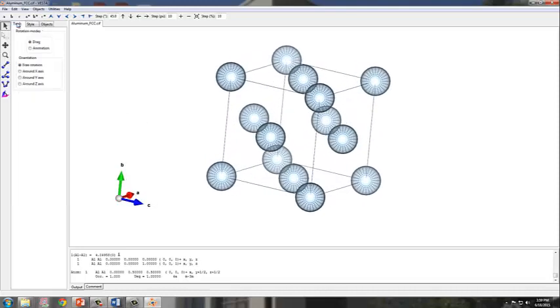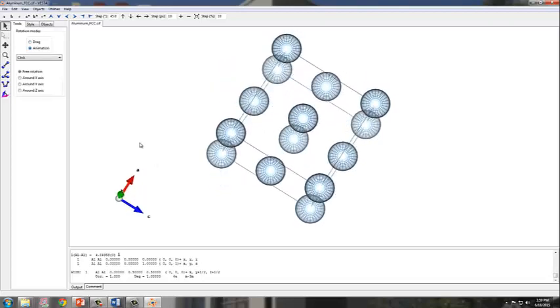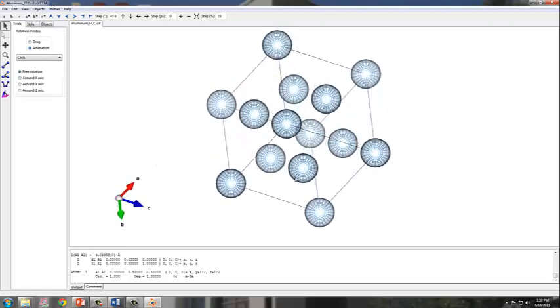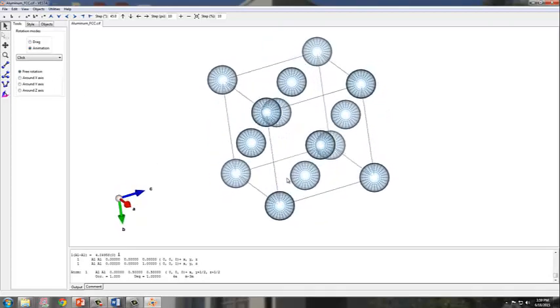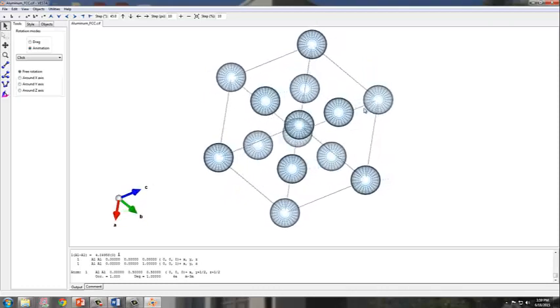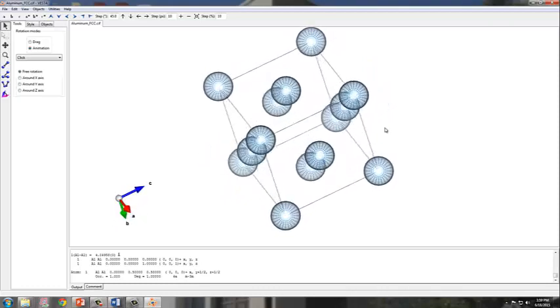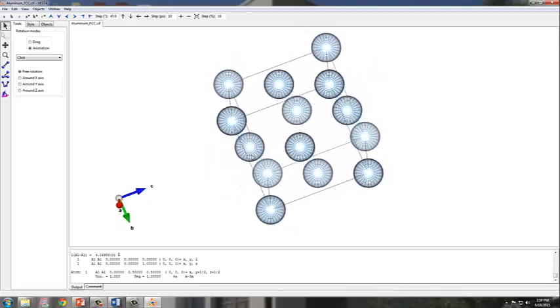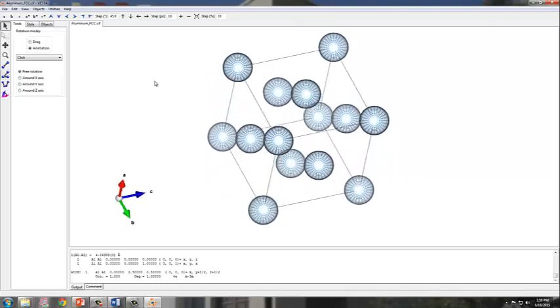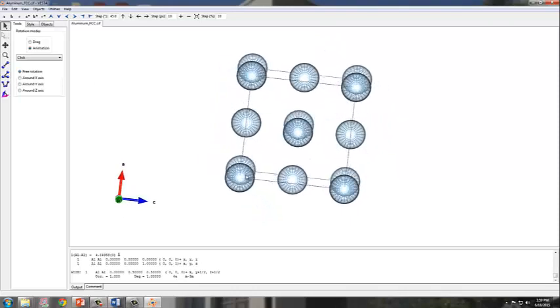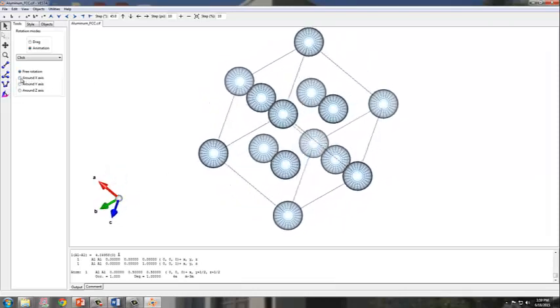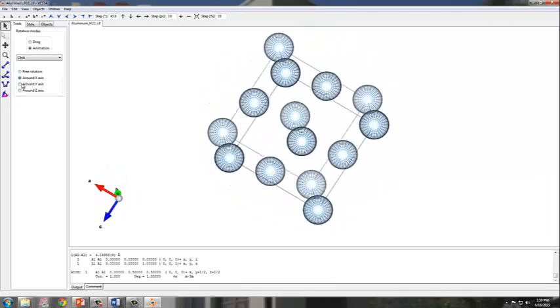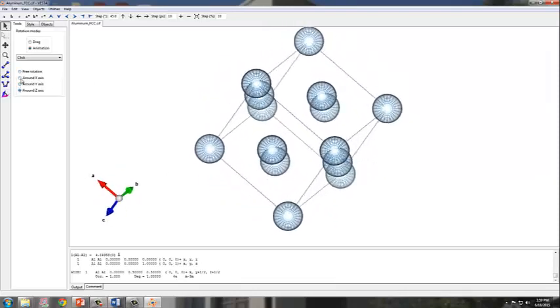And if you go to the tools tab, you can also do some animations. If you click on the animation, it'll rotate about particular axes. And you can even control the rotation by left clicking. Or you can have it rotate about specific axes.